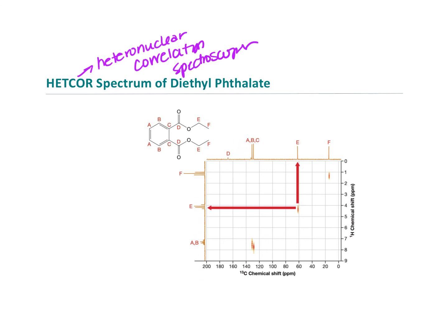So two-dimensional NMR spectroscopy from the COSY and HETCOR become much more important in the elucidation when molecules are more complex than the ones given in examples here, like proteins. Proteins are much more complex. Moreover, there are a lot of other 2D NMR techniques, each of which provides distinct information about molecular connectivity. You can also get into 3- and 4-dimensional experiments and still other NMR techniques. So the end idea here is that we're really just scratching the surface.